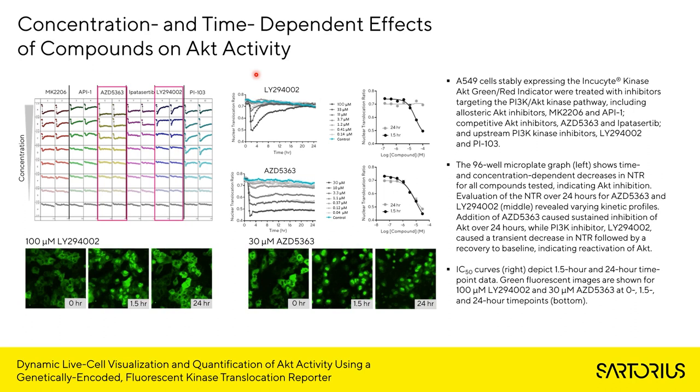The 96-well microplate graph on the left here shows time and concentration-dependent decreases in the nuclear translocation ratio for all compounds tested.